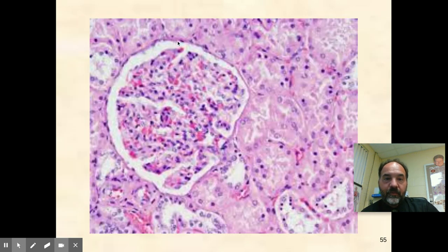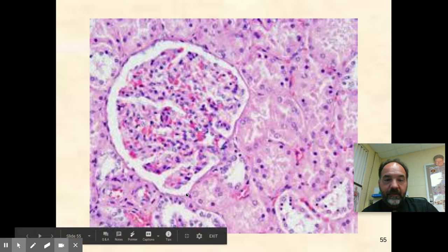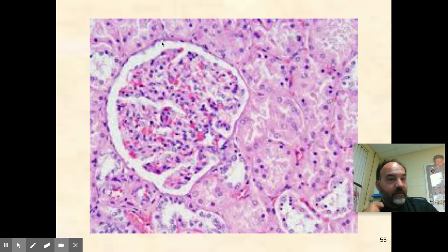This is simple squamous epithelium in the kidney. All around the edge of this lumen, it's lined with these super thin cells. Super thin, simple squamous cells. Because the kidneys are filtering our blood, producing urine.